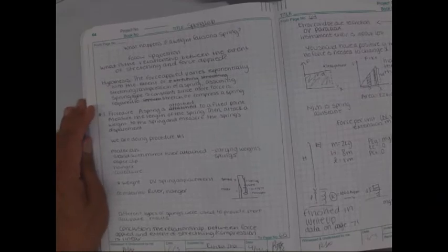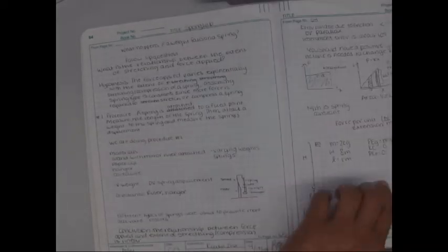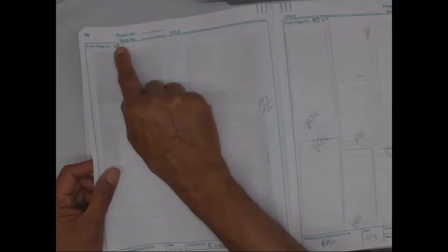Here is one example of carry over to a different page. So here you see that the person says page number 65, but then the next page says page number 71. That means she has not followed on with this one here, but she has continued the work in page number 71. She should be continuing from page number 65 to page number 71. And therefore, she has made an error there and she's struck it off later.